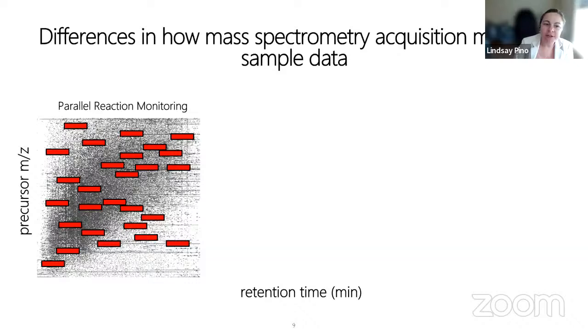So we're going to visualize DIA using these ion maps. In these ion maps, going up and down vertically, it's the precursor MZ. Just imagine a very low MZ value, mass to charge value, and then it increases all the way up to very high MZ values. You can think about it as very small peptides at the bottom and very large peptides at the top. And along the horizontal axis, going left to right, is the retention time, that LC gradient that Sue had mentioned. At the very beginning on the left-hand side, those are very hydrophilic peptides. And on the right side, there are very hydrophobic peptides.